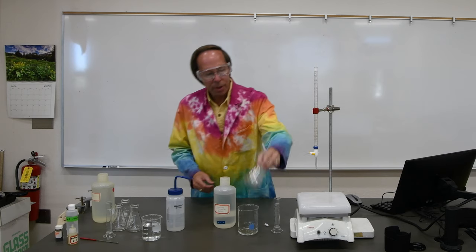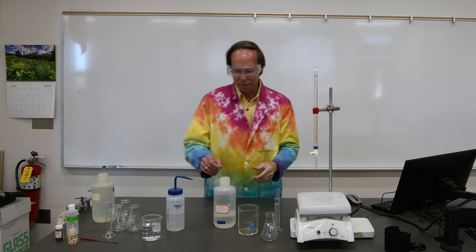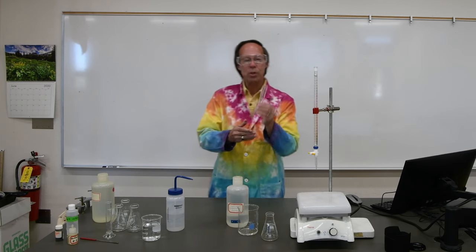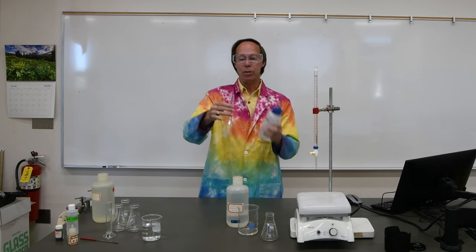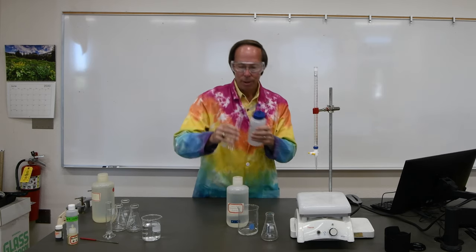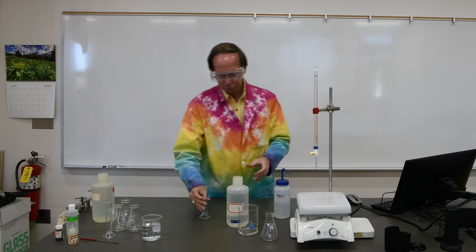We're going to carry out the titration in a 125 milliliter Erlenmeyer flask, and we want to use approximately 25 milliliters. To measure the sample of calcium, we're going to use a 25 mil graduated cylinder. Again, we need to make sure it's clean. So I'm going to rinse it out a couple of times with some deionized water just to make sure there's no calcium in there from a previous experiment.